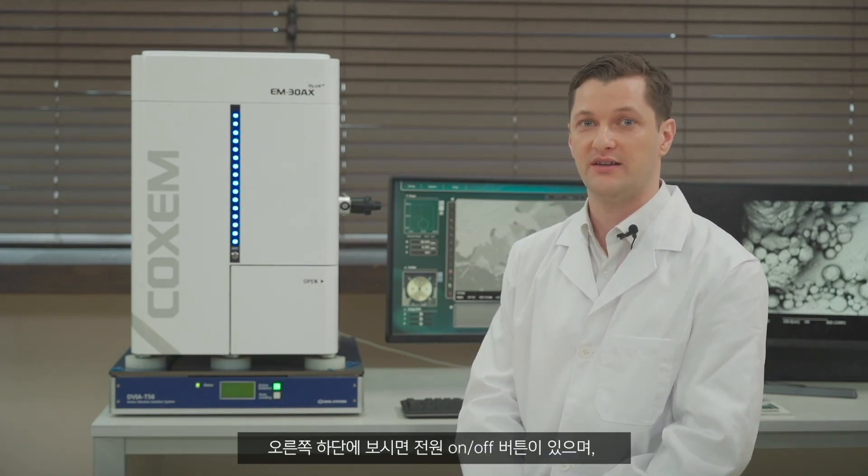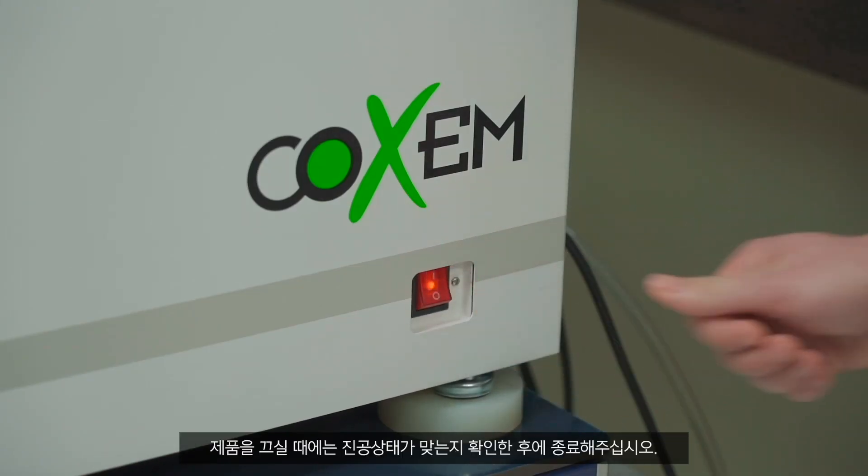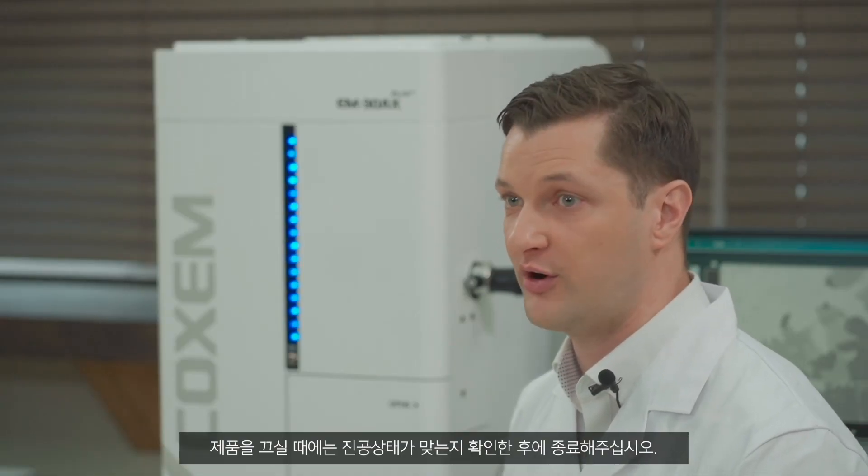The power button is on the right side of the bottom of the microscope. Remember to always make sure that the microscope is in vacuum state before you turn it off.